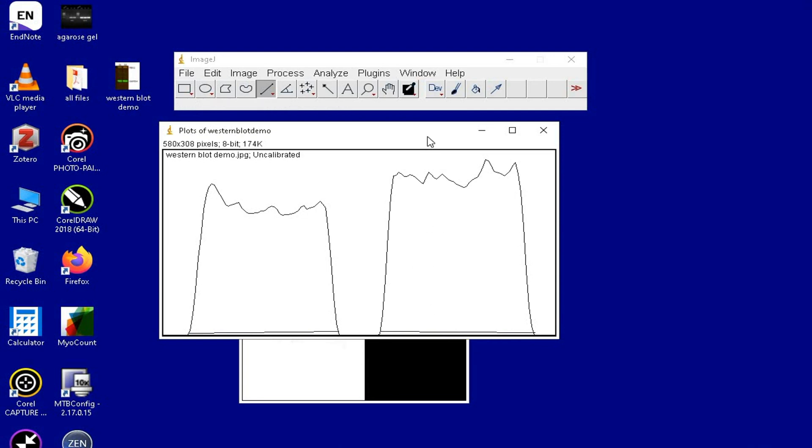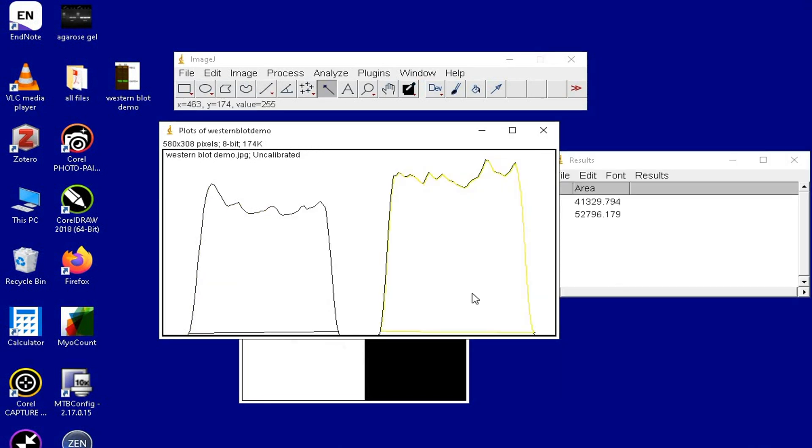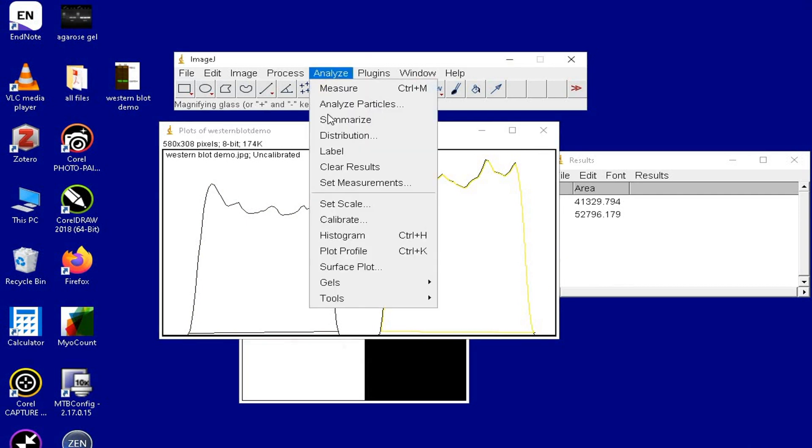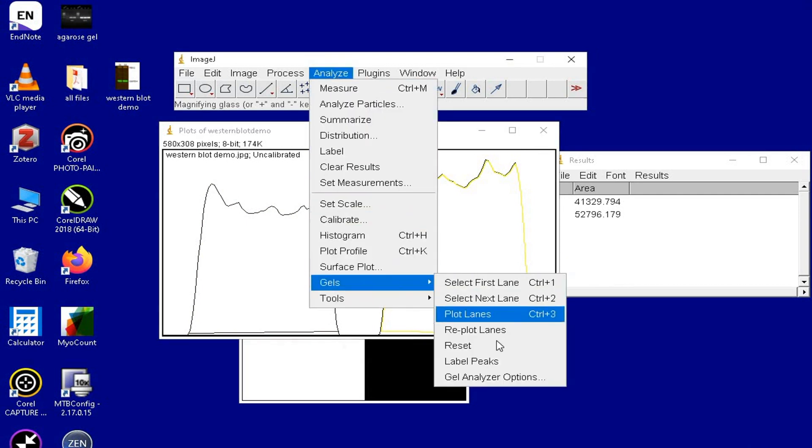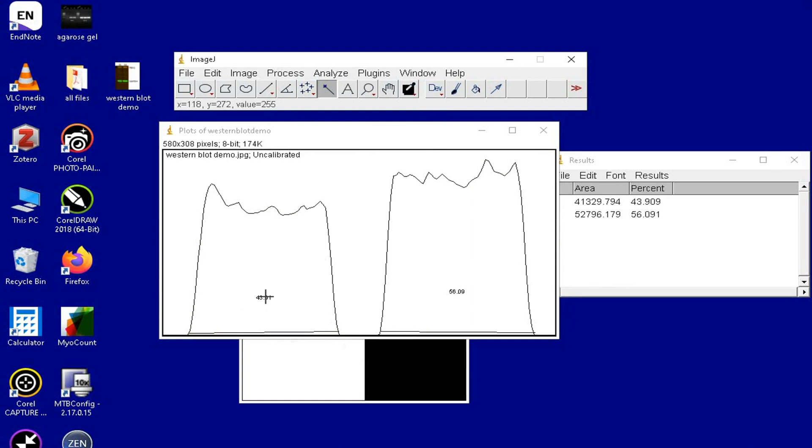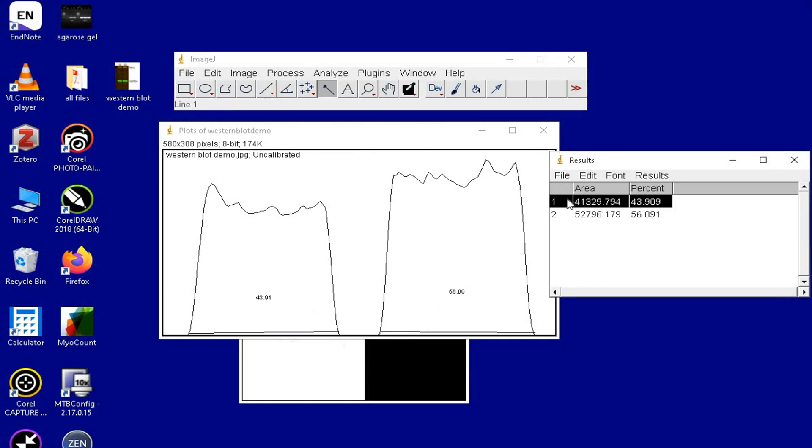Once completed, select the wand tool from above and click within the enclosed plotted lanes. Again, click on Analyze, Gels and then Label Peaks. This step displays the percentage area of the occupied intensity.